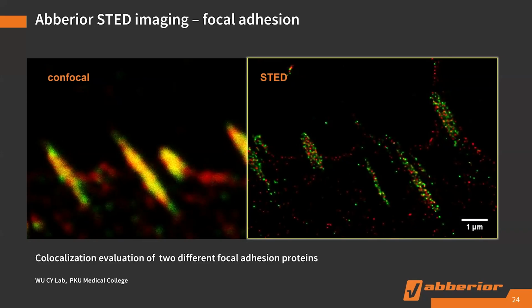Here, I have another interesting data set. Another customer knows that there's strong interaction of the 2 proteins, but he still got the same image as you see now on the screen. On the right side, there's no interaction. Then later, we found out the interaction of his proteins happens at the N-terminal of the protein.